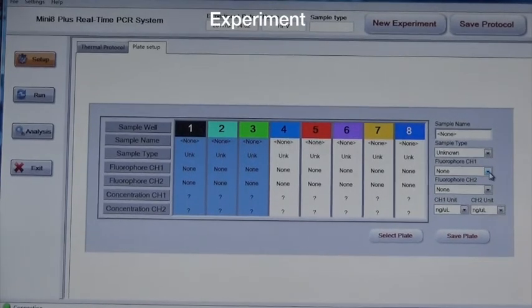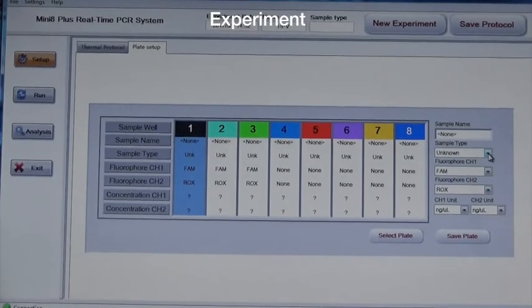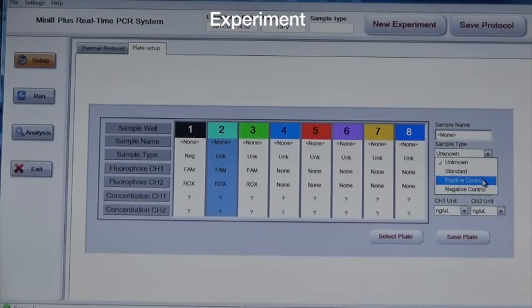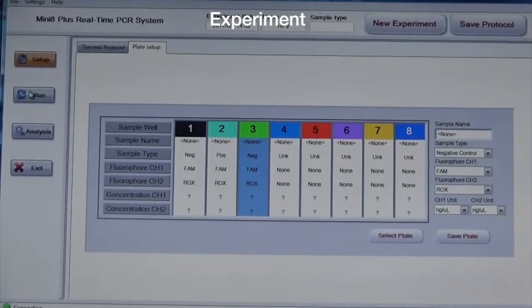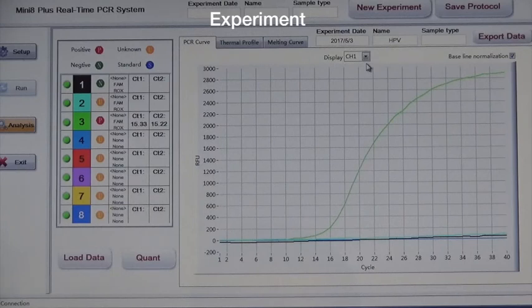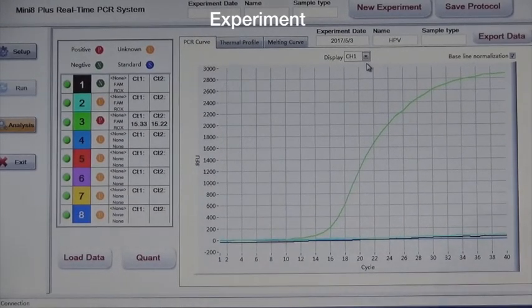Fourth, set up sample plates. Fifth, click running and then start. Sixth, read the results and export the reports.